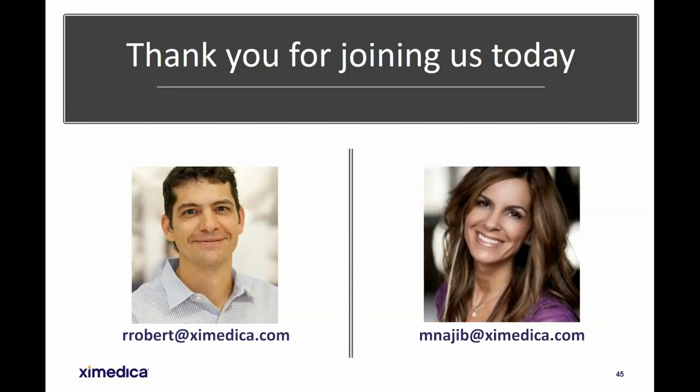Here's a question in regards to infectious disease. Thanks for the talk. I appreciate the example of lung cancer. What opportunities do you see for NGS in infectious disease? Yeah, and Rene, I can take that one also. So really the monitoring of emerging pathogens, such as respiratory viruses or antibiotic-resistant strains of bacteria.